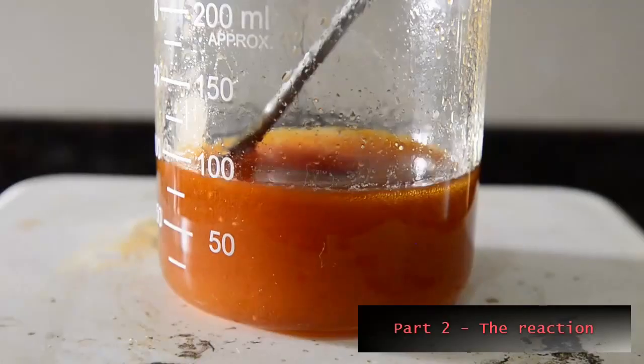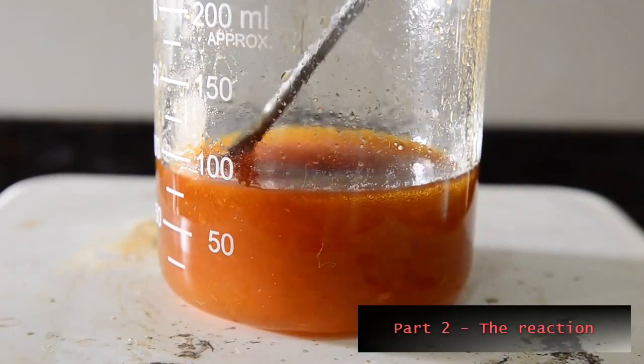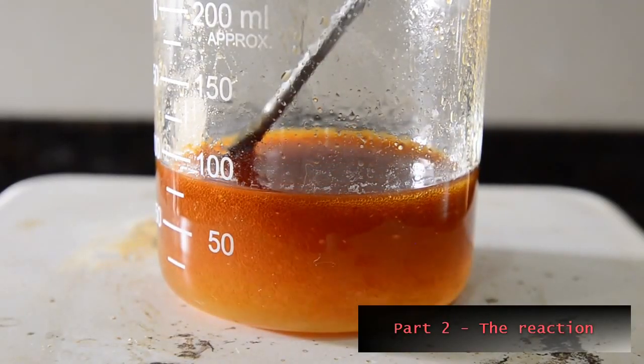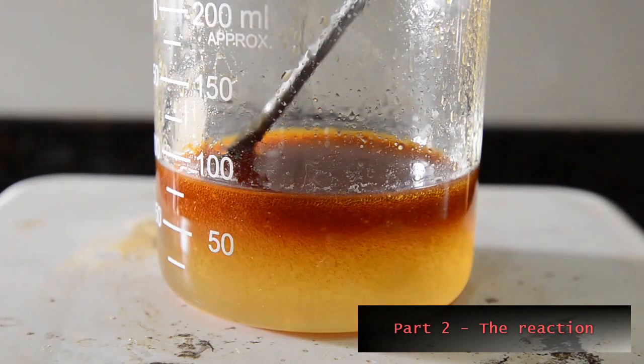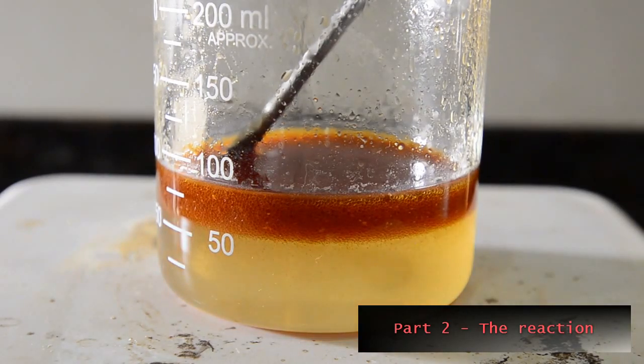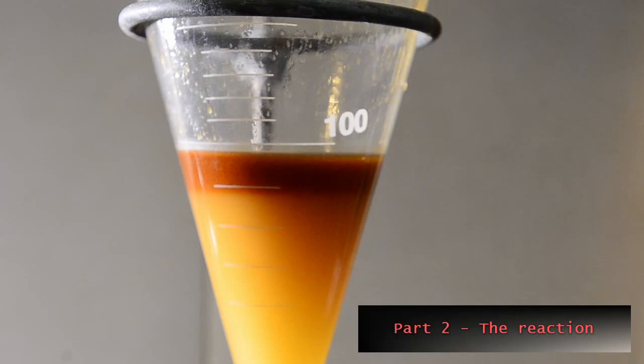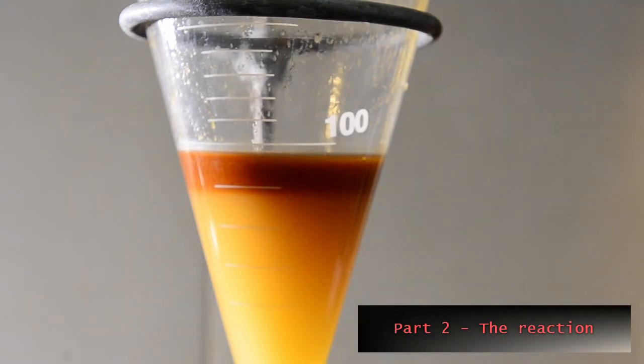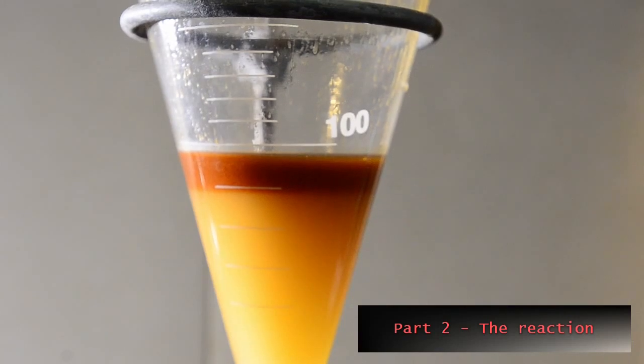Continue stirring for 20 minutes. At the end of this period you should see the mixture separate into two layers. Place the mixture into a separating funnel and separate it. Reserve the oily top brown layer. This contains our crude mandelonitrile intermediate.